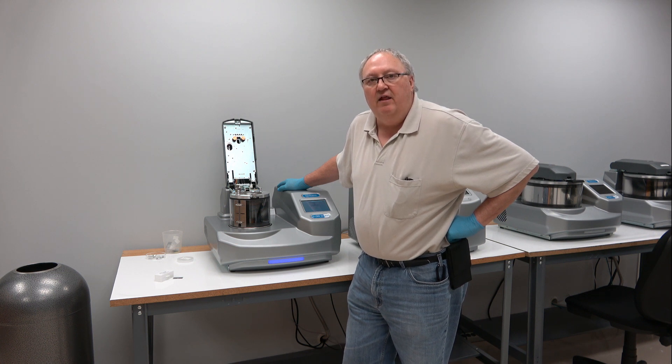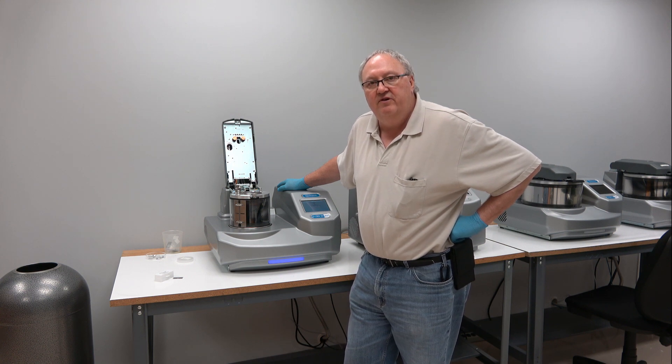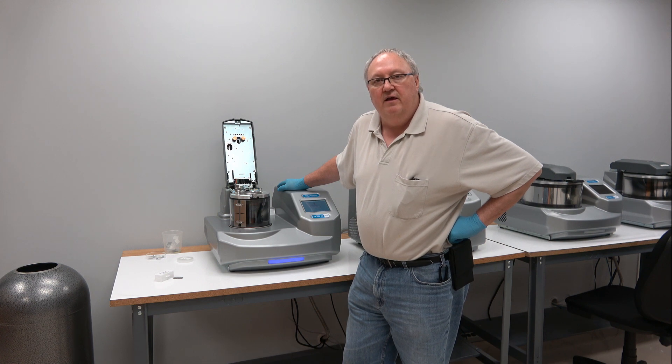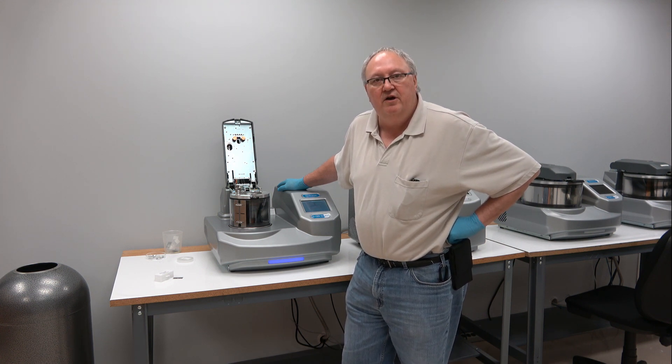Good afternoon, this is Al. I'm the Applications and Service Manager at Electro Microscopy Sciences and I'm going to show you how to set up and operate a pulsed carbon rod profile in the Q150 series coaters.